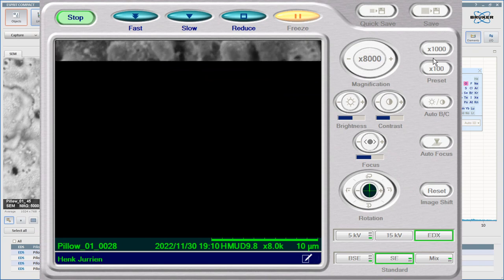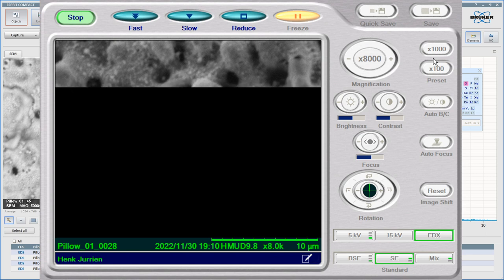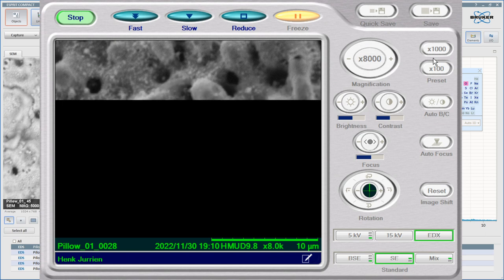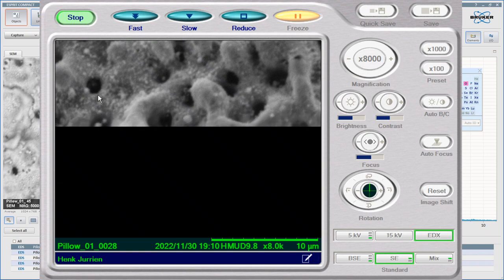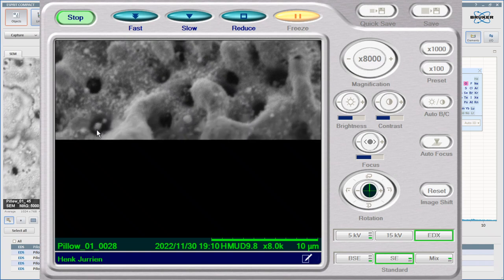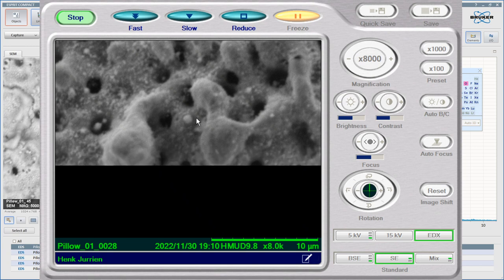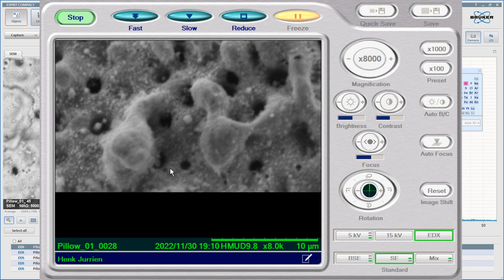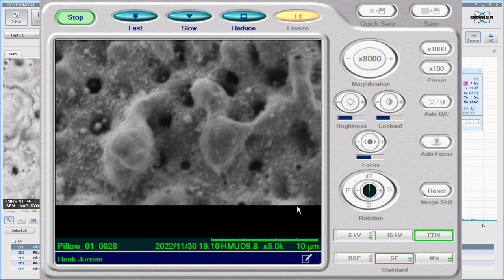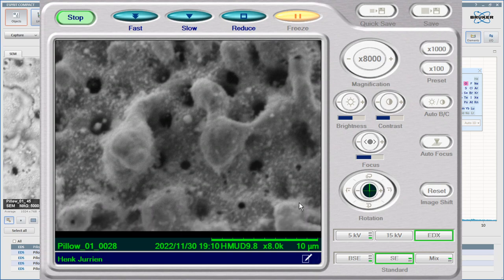So we're actually looking at the secondary electrons here. And this is the one that gives us the best topological view of what is going on. So yeah, you can see here, it definitely looks like to be something in these pits. Okay. And is this a peak and this a pit? An outie and an innie. Don't know. It was a bit of a surprise to see this thing perforated like a tea bag. But there we go.